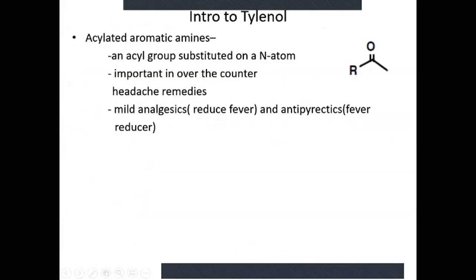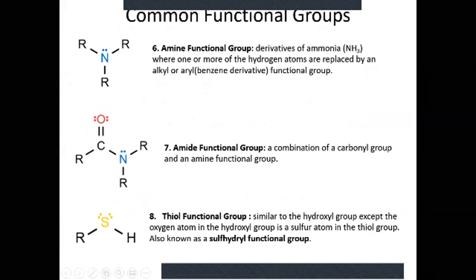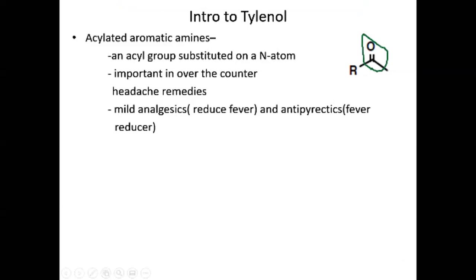So with Tylenol, what we're doing is we're acylating aromatic amines. So what's acylating? Acylating, we talked about this last week. We're adding this acyl group, which is this right here, to an aromatic amine. And the acyl group is substituted on the nitrogen atom.